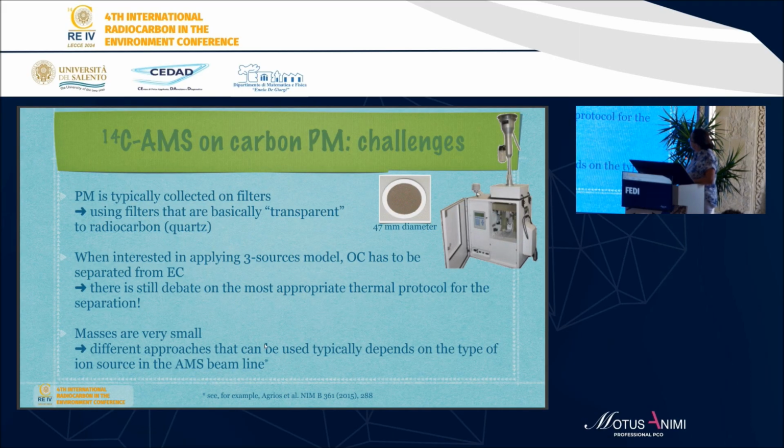Which are the challenges if we would like to apply radiocarbon to such material? Well, PM is typically collected on filters, and here you can see a typical quartz filter on which the particulate matter has been deposited. Of course, we have to use filter materials that are transparent to radiocarbon, and the choice is, of course, quartz.